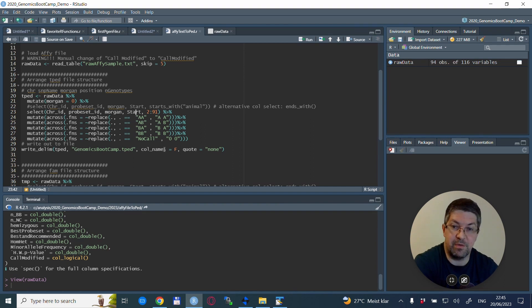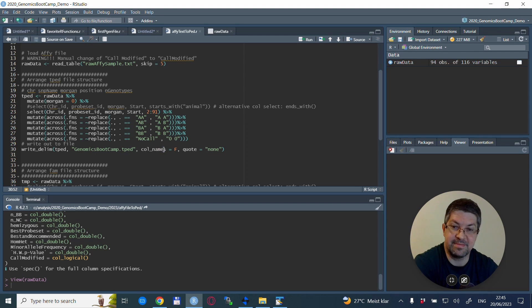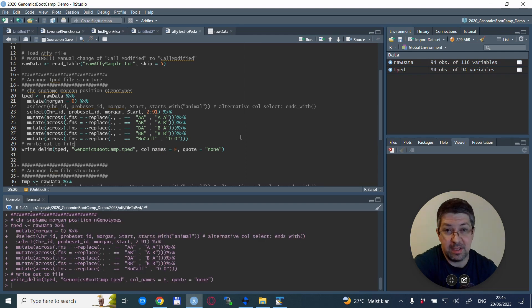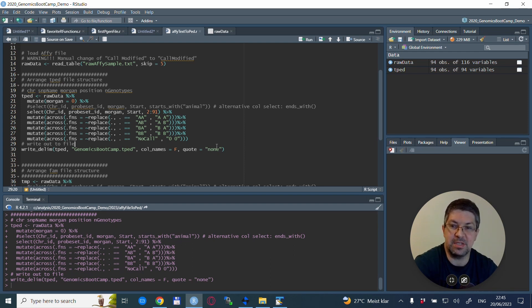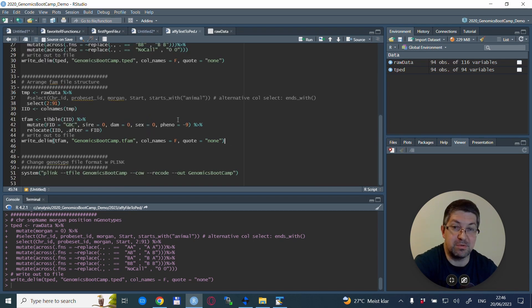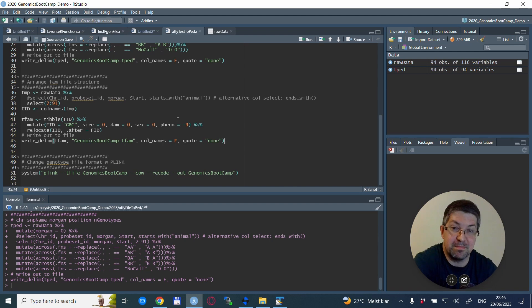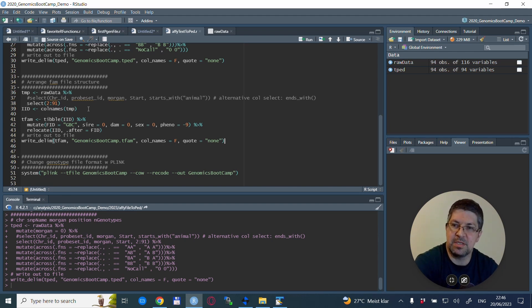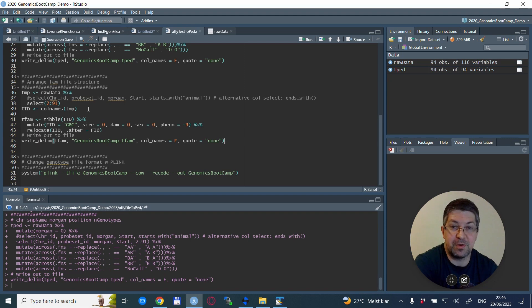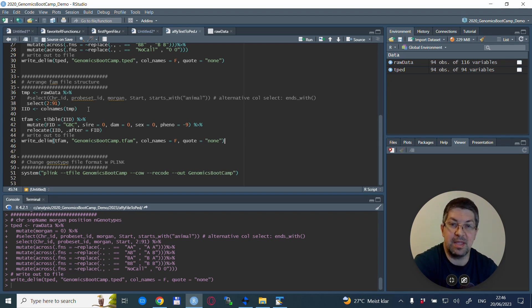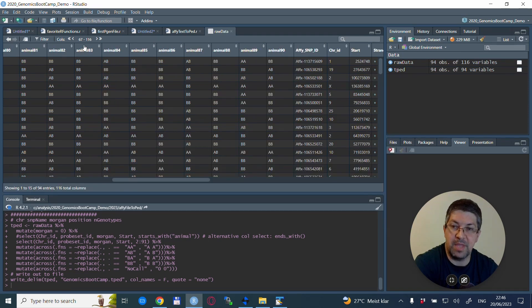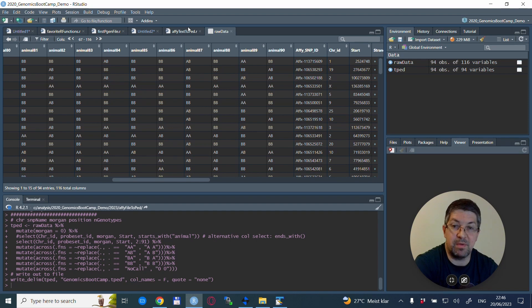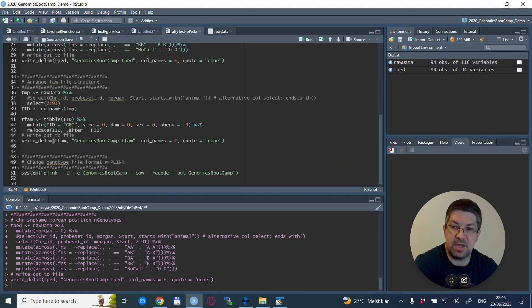And that is the chromosome ID that is in the raw file already, the probe set ID that is basically the SNP name, the Morgan position that we created—this is just a column of zeros—and the start, the column name start, is actually the base pair position. And then we select the columns 2 to 91. We do this replacement, and we write out with the write_delim statement the tped file. And that is most of the work done already.